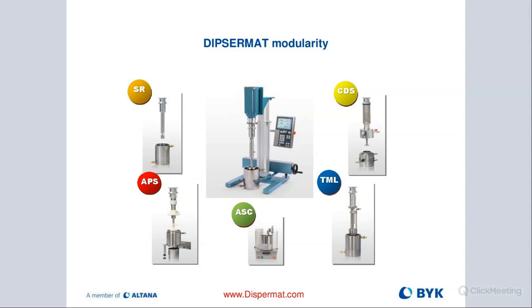That's kind of like a quick change system, and it can be attached in less than 1 minute with this bayonet style clamping ring. You remove it and you turn this assembly 180 degrees. And now you're able to just pop on a basket mill.